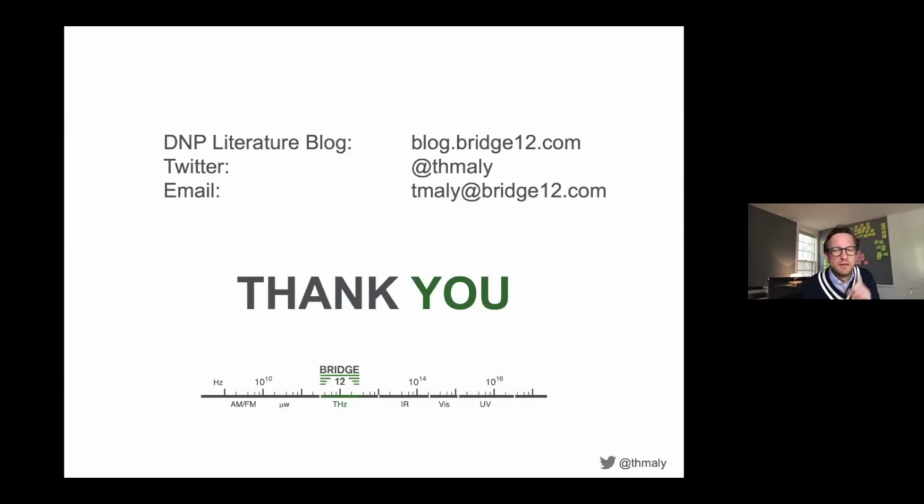So first of all, I would say 5G technology is fantastic for EPR spectroscopy, because of the frequency regime. There's the higher frequency, the backhaul frequencies, where there's a lot of progress, but in Q-band, like 28, 30 gigahertz, what you see coming out from 5G there is fantastic. And I think this will also lead to further smaller spectrometers and all that. That's fantastic. So, the X-band EPR was riding on the radar wave from after the Second World War, and now I think for Q-band we will ride on the 5G wave for a long time.